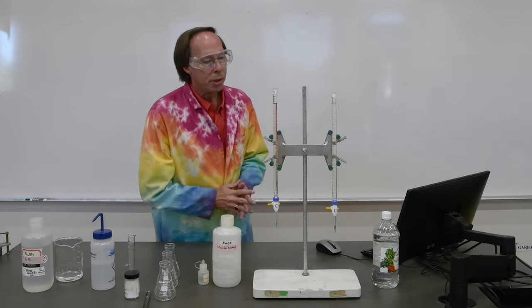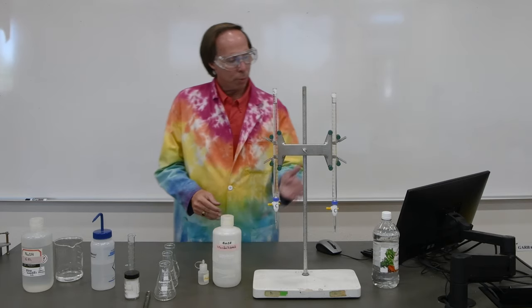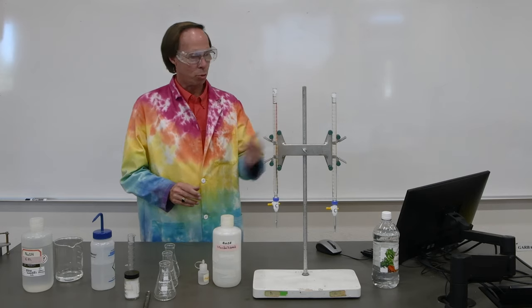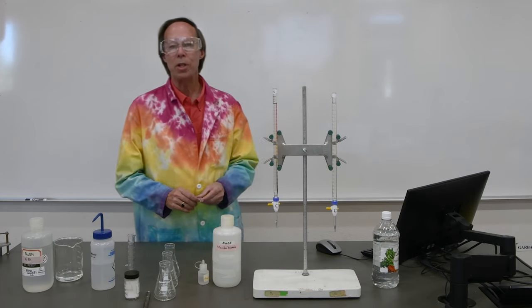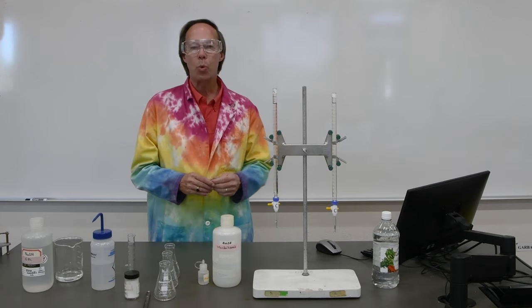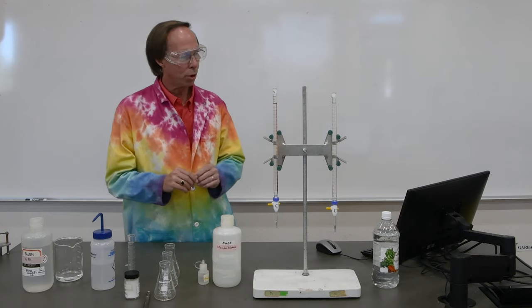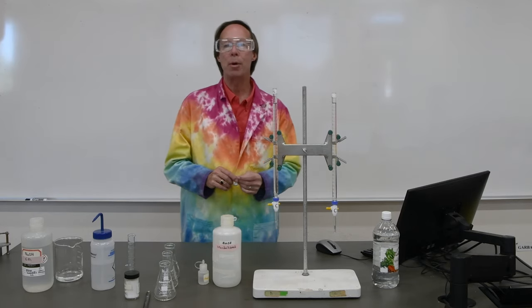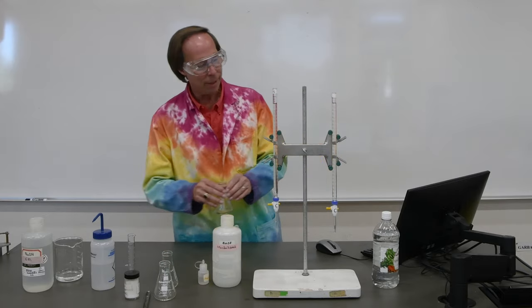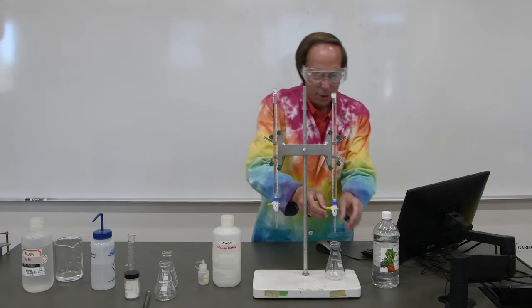Now, if you remember when we did the water hardness titration earlier in the semester, when we first tested our unknown and we didn't have a good idea of how much it was going to require to neutralize it, we did one quick and dirty run, just letting the titrant run in quickly and getting a ballpark idea so that then we could do our official two trials where we had a better idea of where the endpoint was going to take place. So I think we'll do the same thing today. So we're going to run sort of just a dry run here.